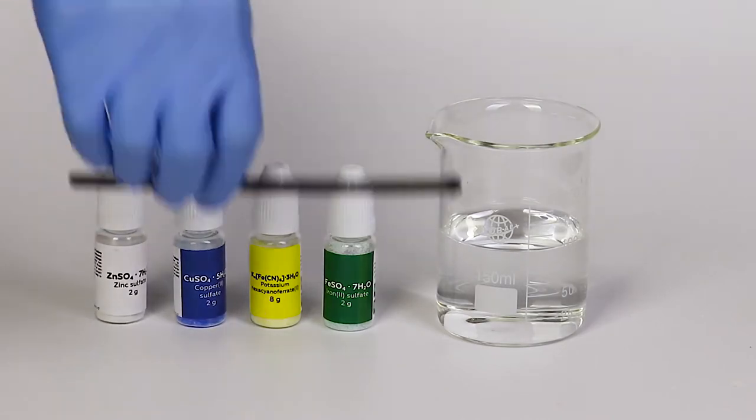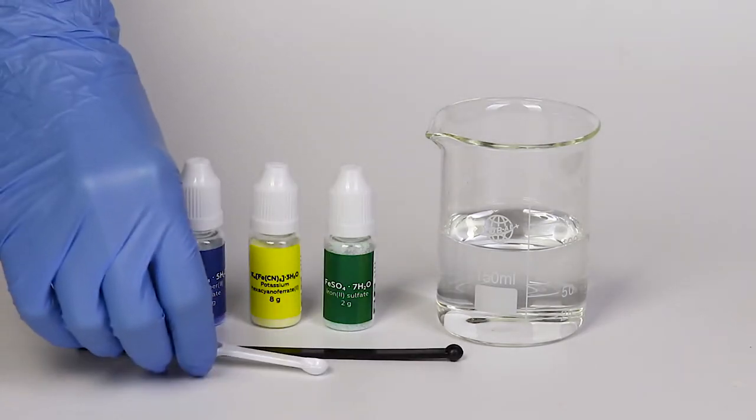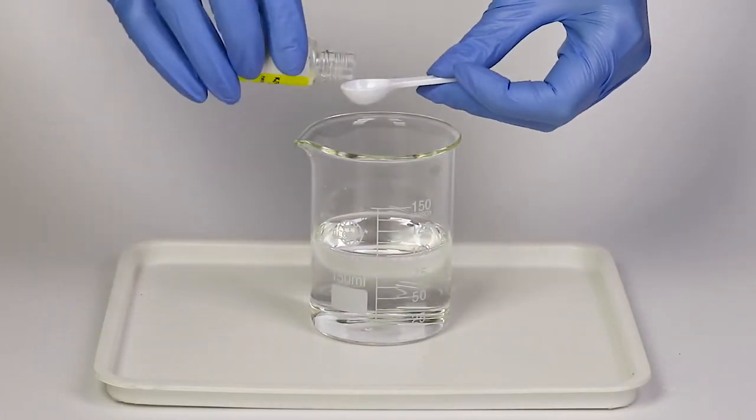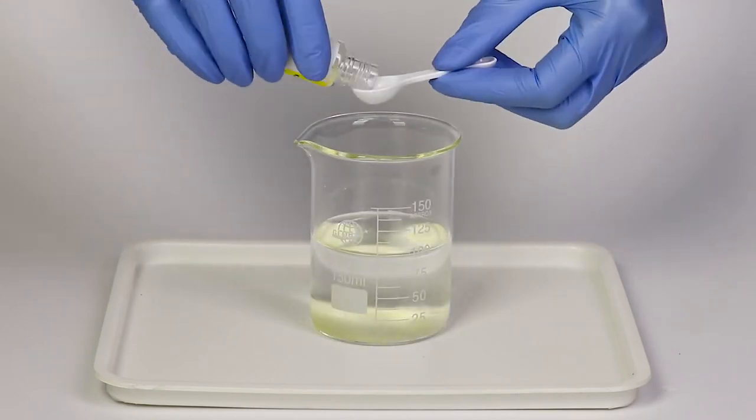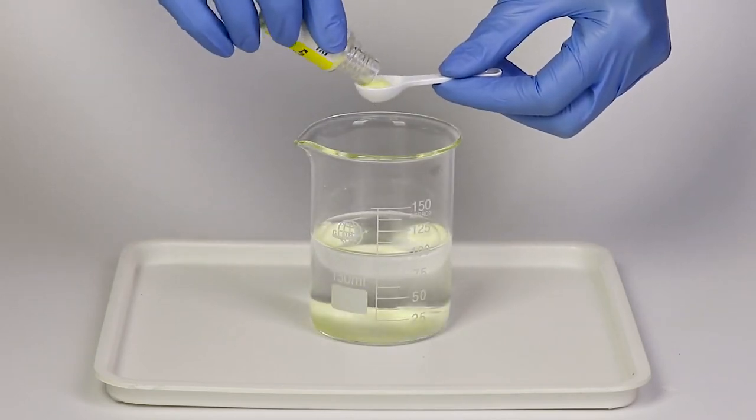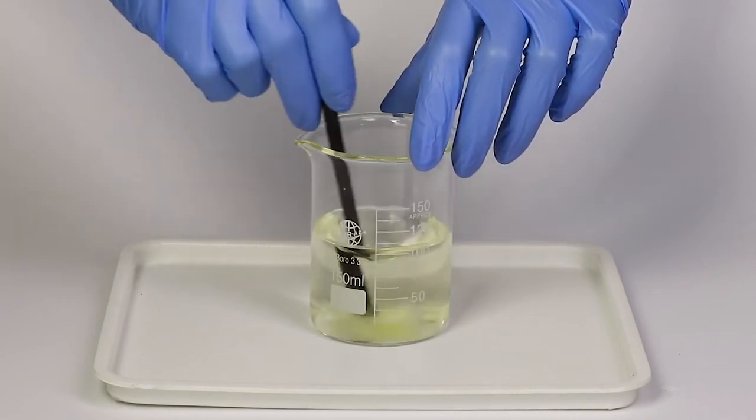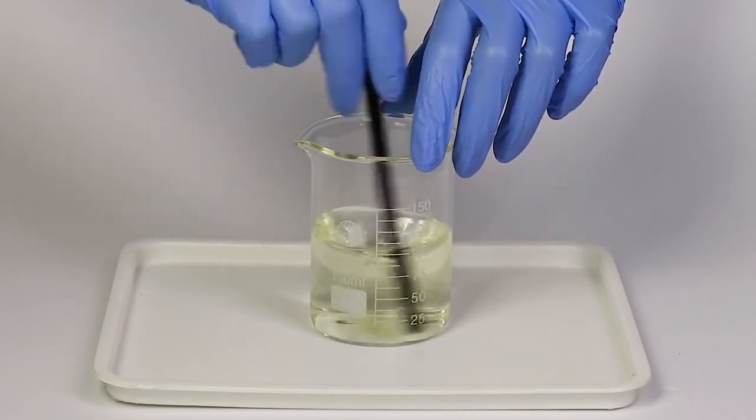You will also need a plastic stirring rod and a measuring spoon. In a beaker with water, add two big spoonfuls of potassium ferrocyanide and stir the mixture with the stirring rod until the potassium ferrocyanide is dissolved.